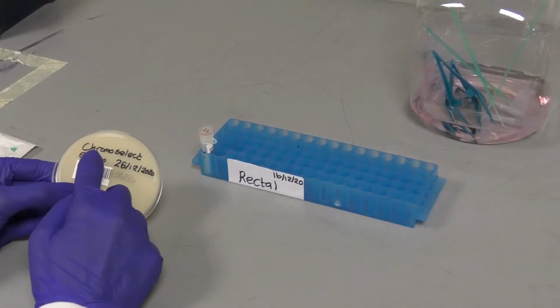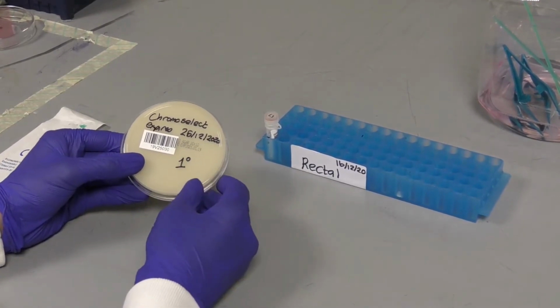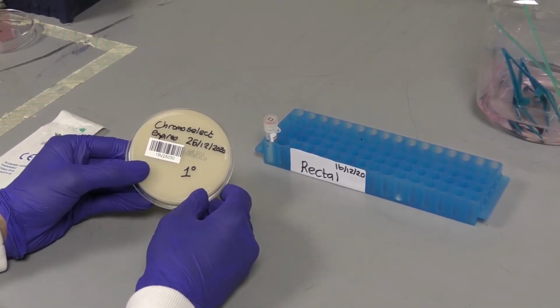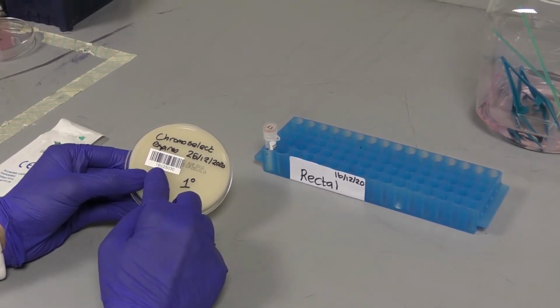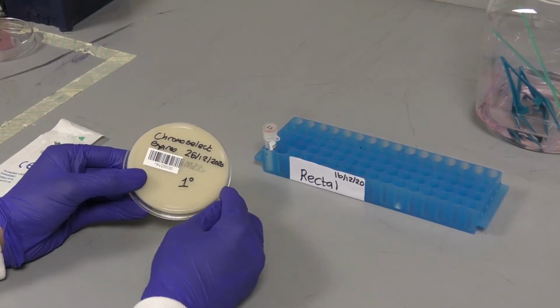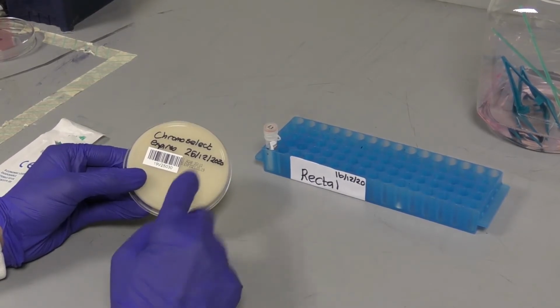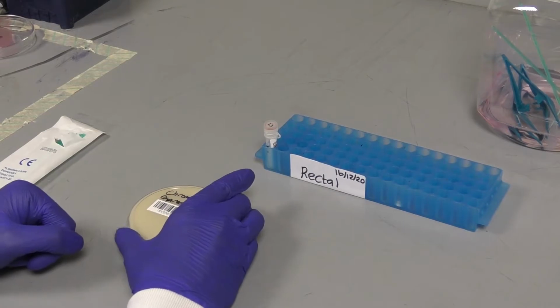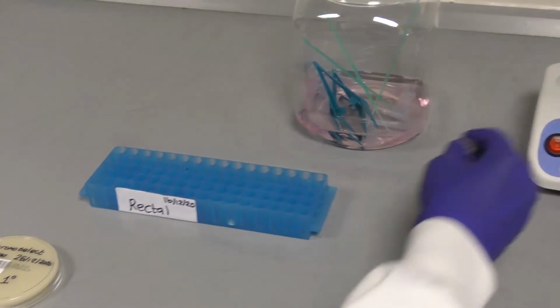For rectal specimens, make sure that the plate you're going to use is at room temperature. For rectal specimens, this is the coliform chromogenic agar. Ensure that the plate is in date, that it is labelled with an expiration date, and that it is labelled with the plate type. You will then need to add either a barcoded label or manually label with the specimen details and the date of processing. The plate will also need to be labelled as a primary plate, i.e. 1 and a primary sign.